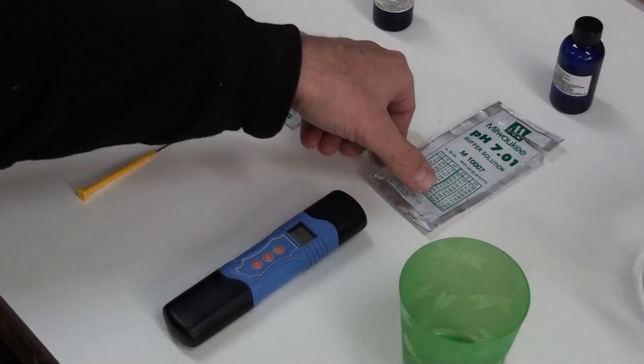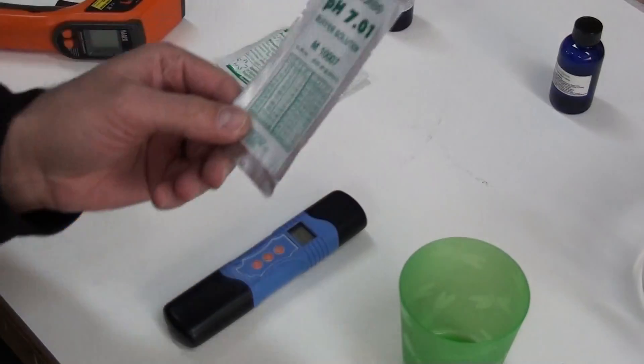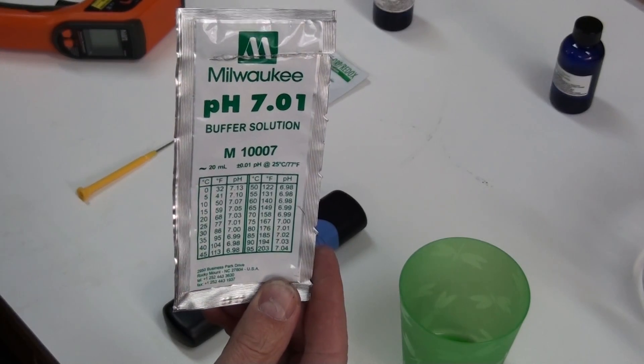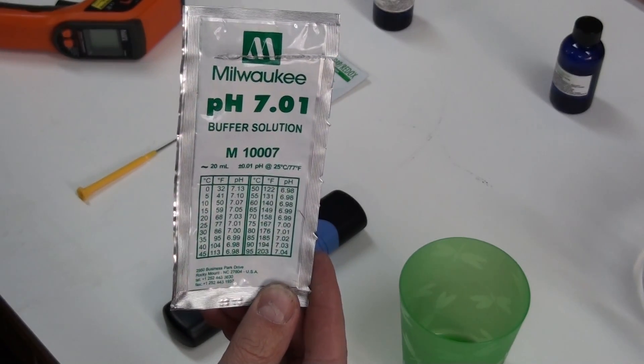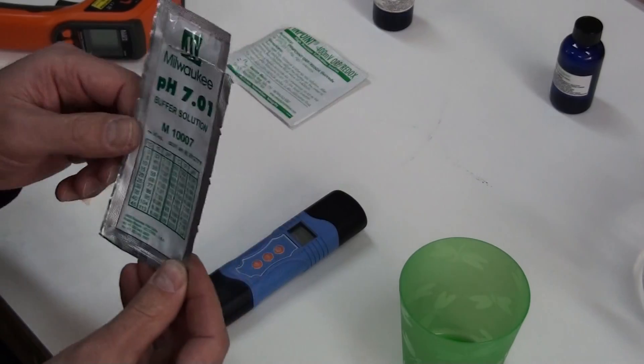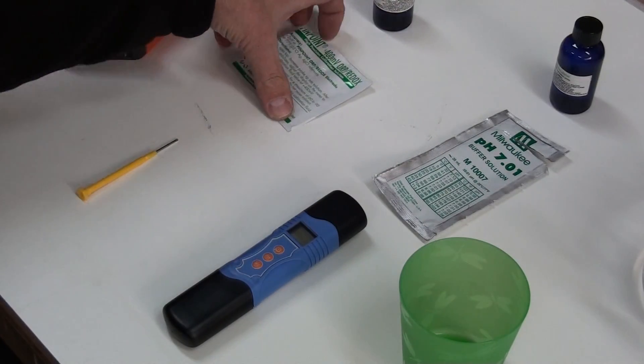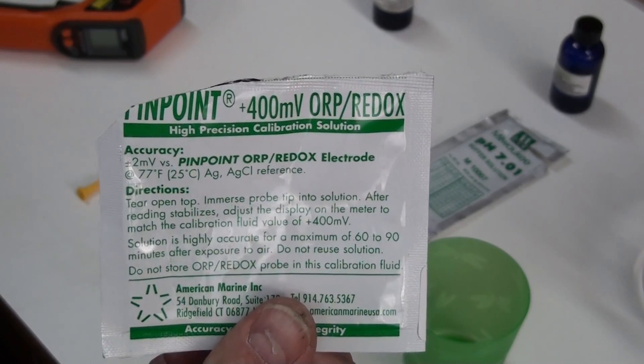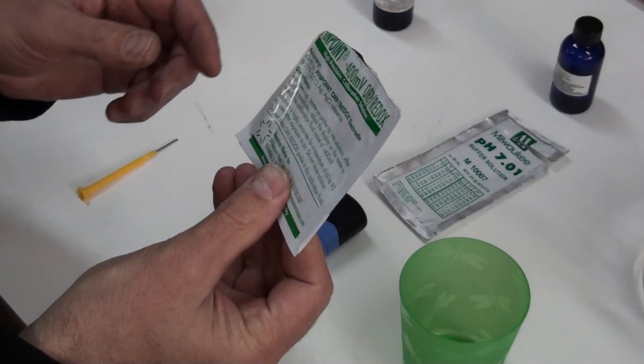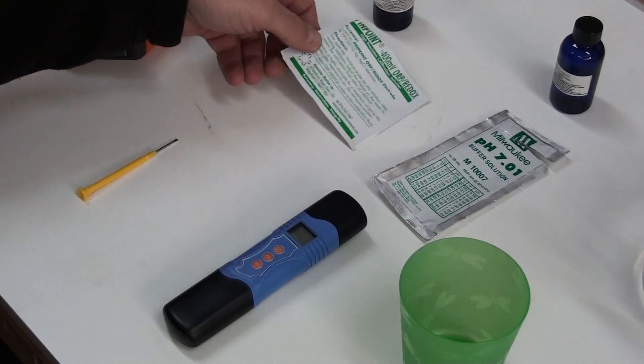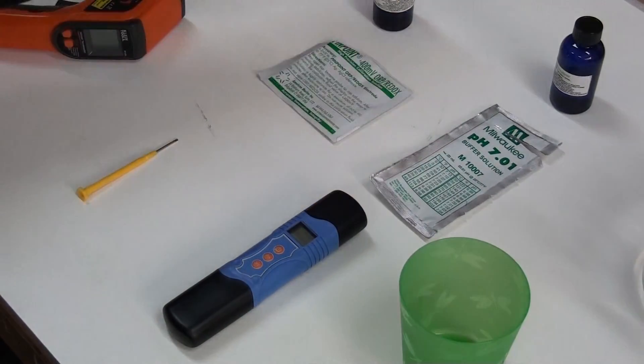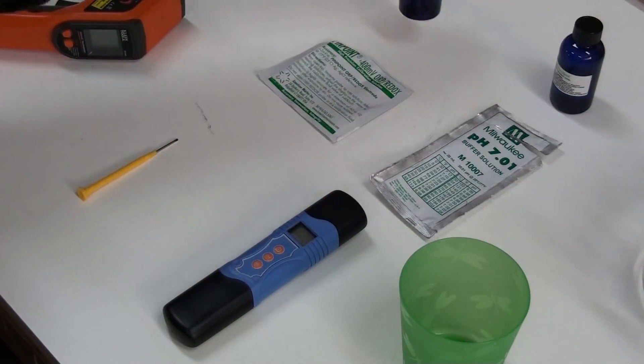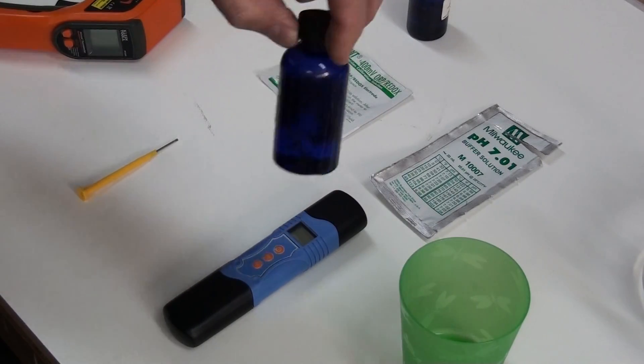And what we do, how we accomplish that is we use some solution that's already pre-calibrated. This is a pH of 7 and for the ORP this is a plus 400 millivolt calibrated solution. I've used these before when I put the solution in these bottles so we'll go ahead and use those.